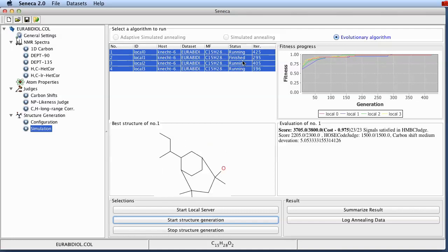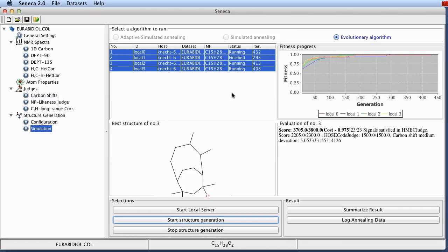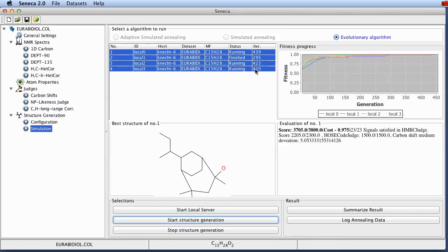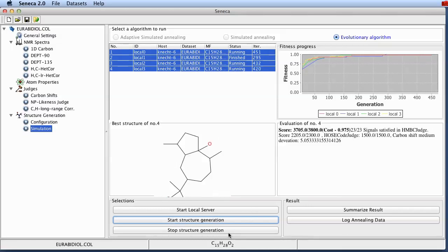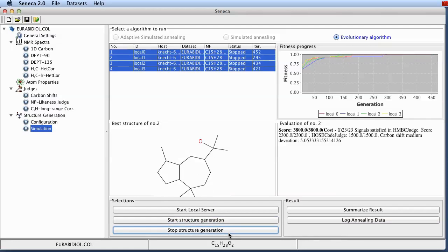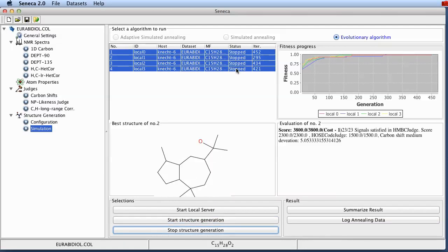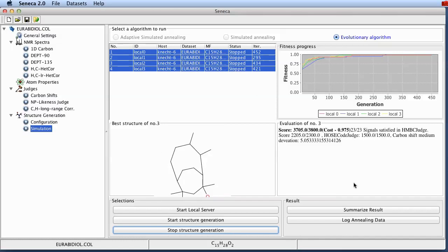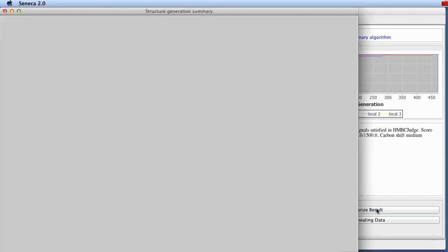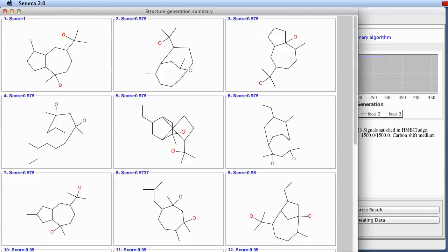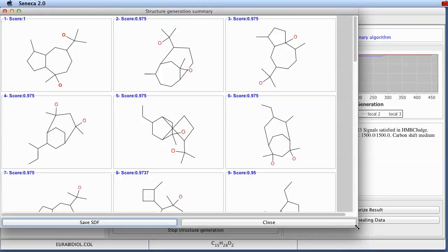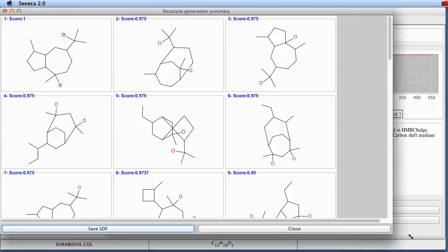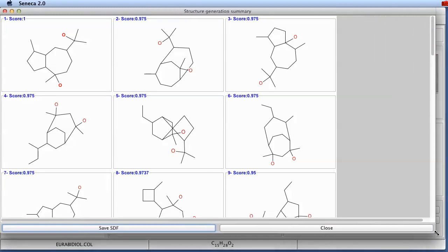For the sake of keeping this presentation short, we're just finishing the structure generation at this step. You can see that now all of the servers are stopped. And you can click on the summarize results window to get a summary of the structures that have been found.